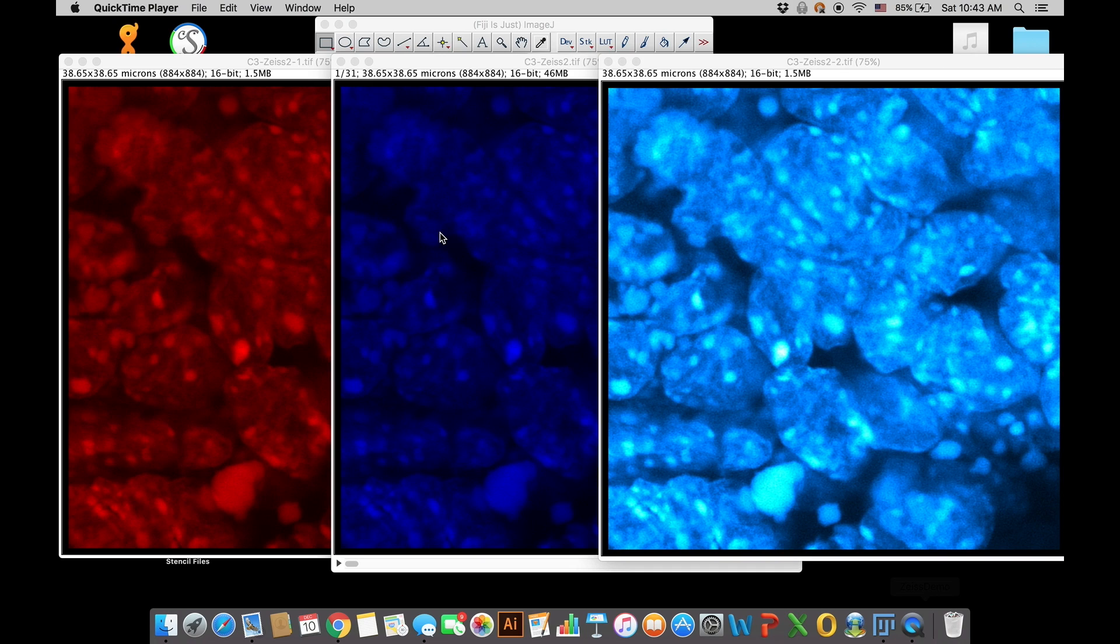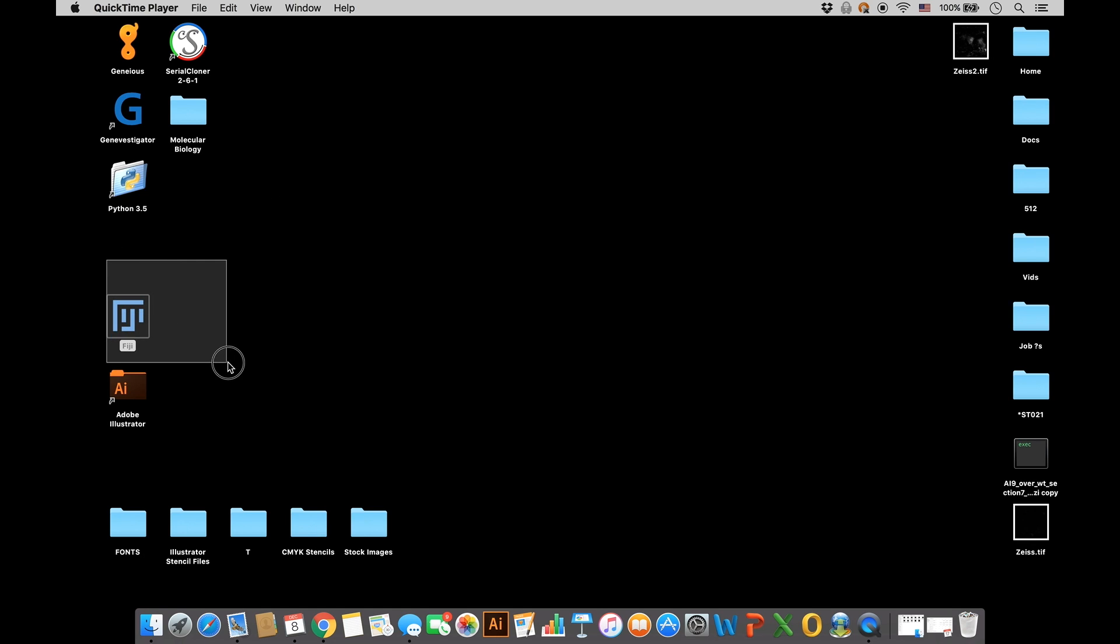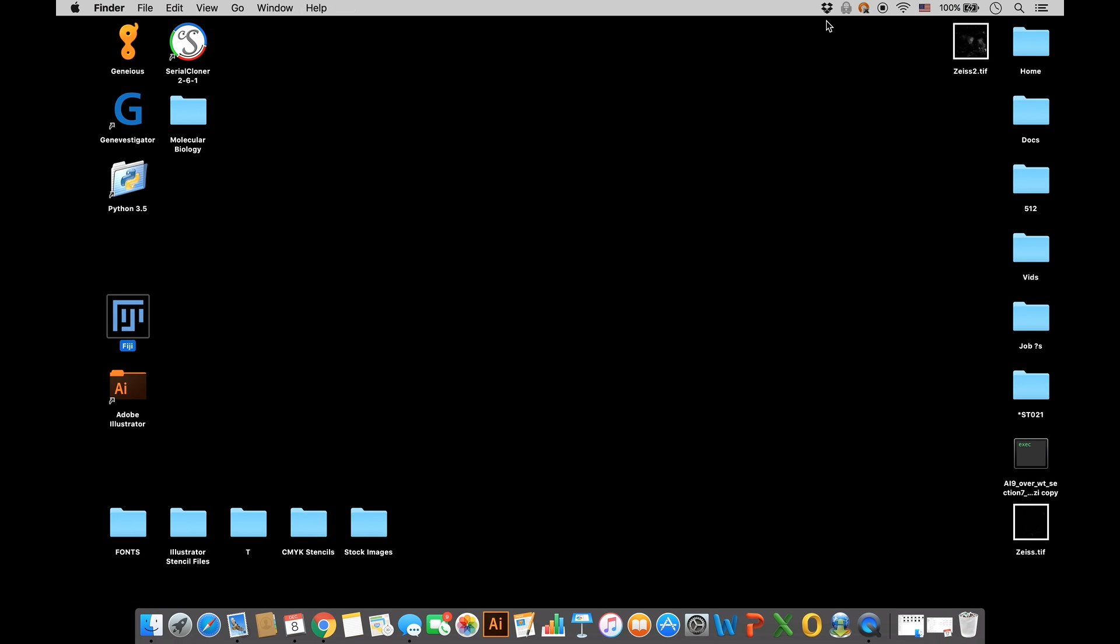Alright, you're here because you want to change one or more channel colors in a microscope image. To get started, make sure you have Fiji, which is free to download online if you don't already have it, and also have your image file ready.